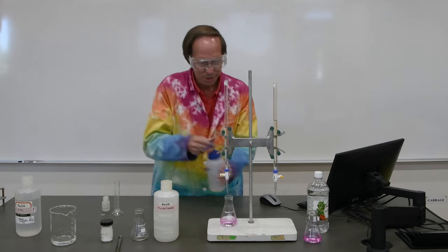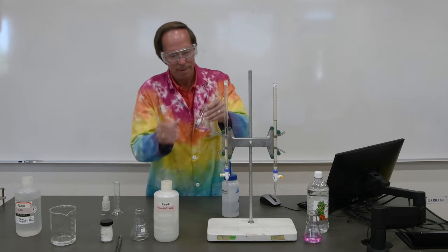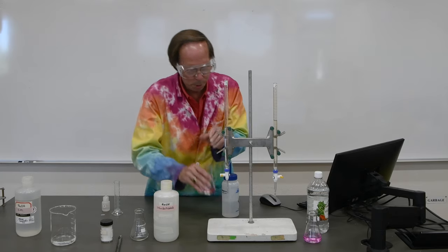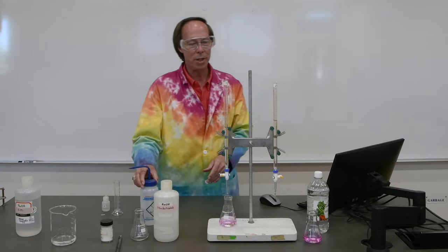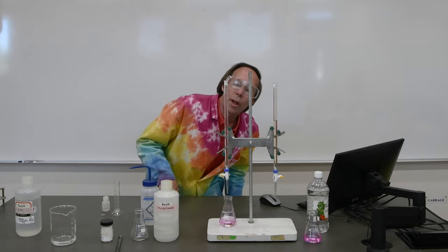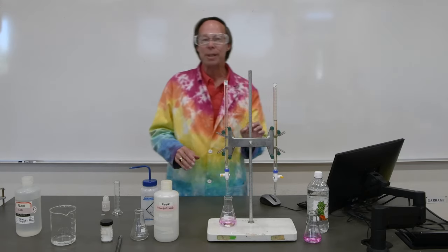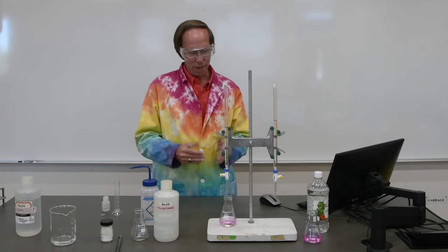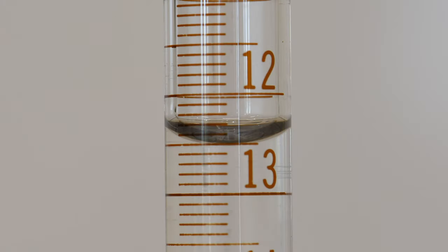So let's go ahead and rinse off that last little droplet there. And it looks like our pink is staying. So we'll give that a few seconds and then we'll go ahead and take a reading. It looks like we're actually fairly close to our rough trial. We took a little bit less because last time we probably overshot. It looks like we're good, so let's go ahead and take that final reading. Go ahead and record the final burette reading for our first titration of the vinegar.